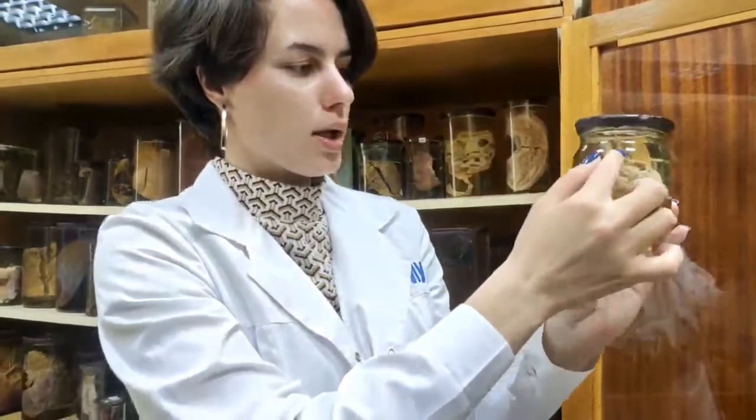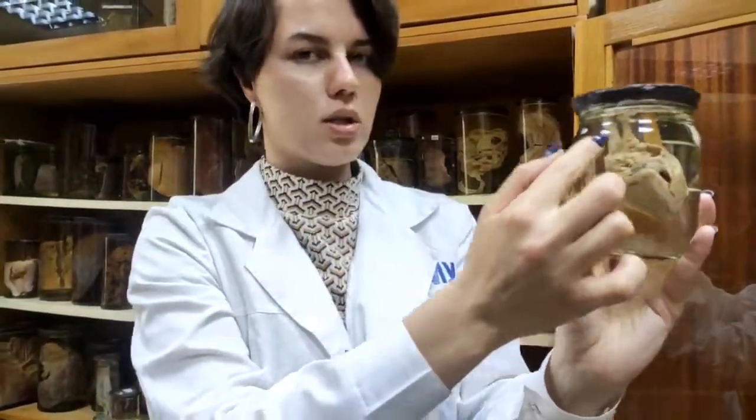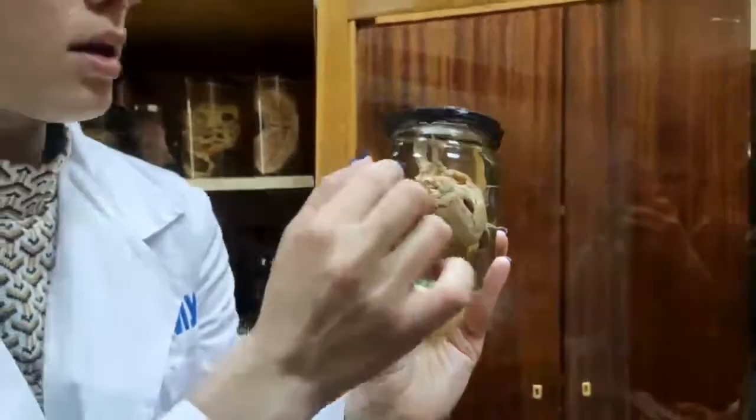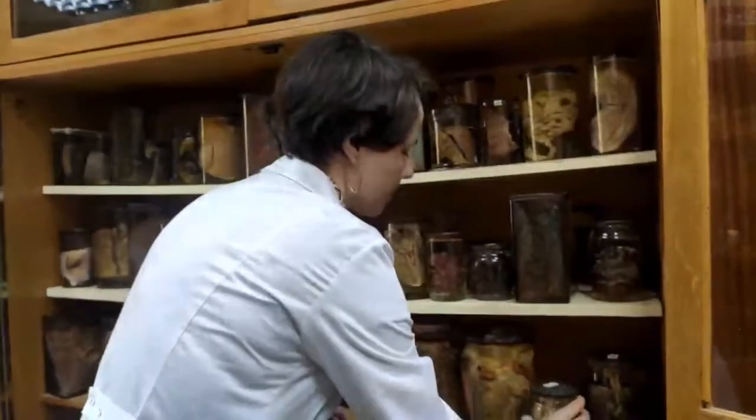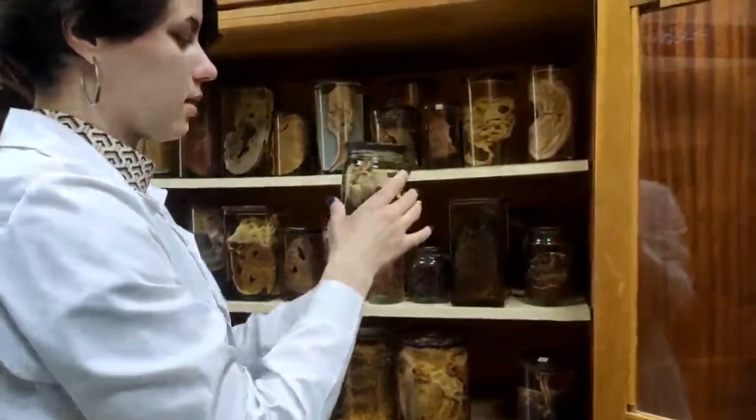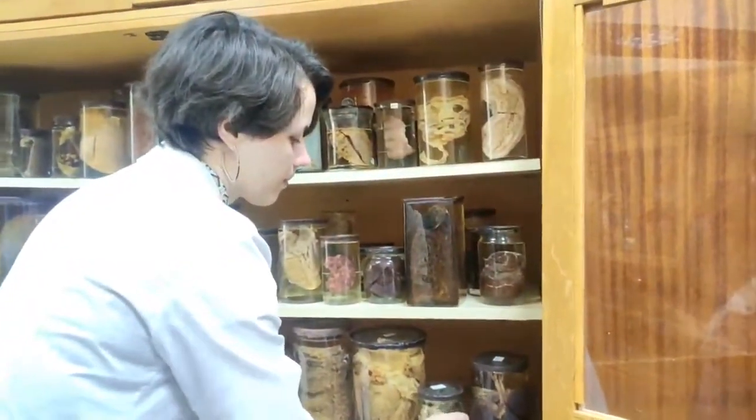And on the valve, you also can see this accumulation, vegetation. Can you see? This small polyp. Looks like polypus vegetation. Is it thromboendocarditis? Thromboendocarditis. Yes.